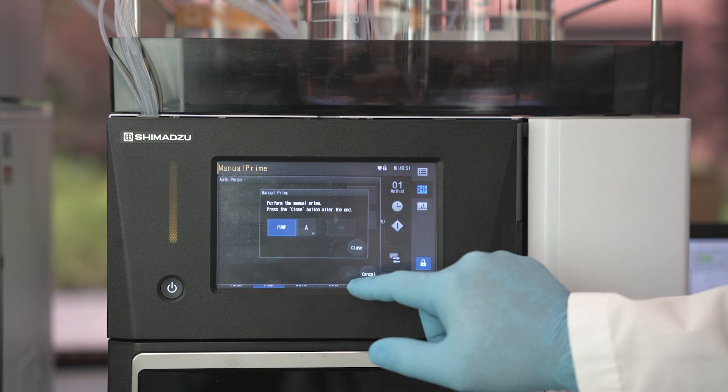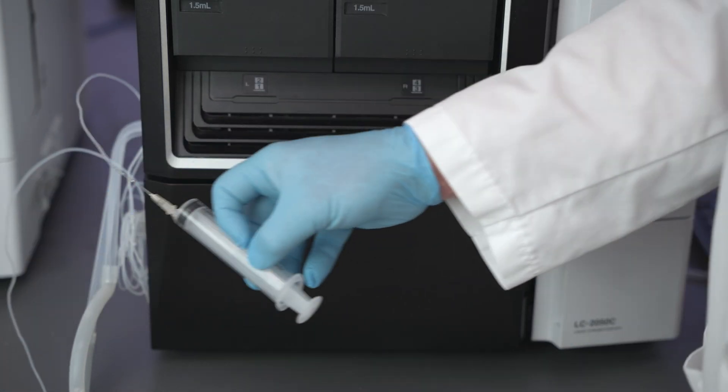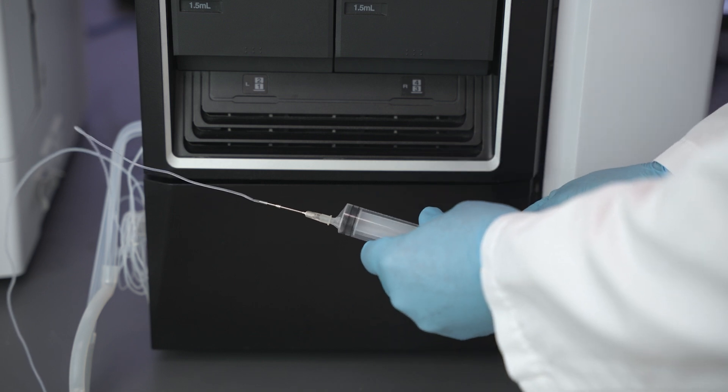Click on pump A and when the pump turns on, this button will turn blue. Pull vacuum with the syringe and collect 10 to 15 milliliters of solvent.